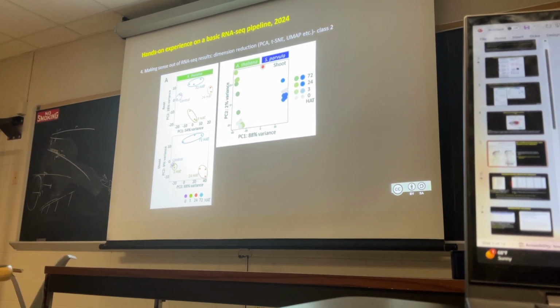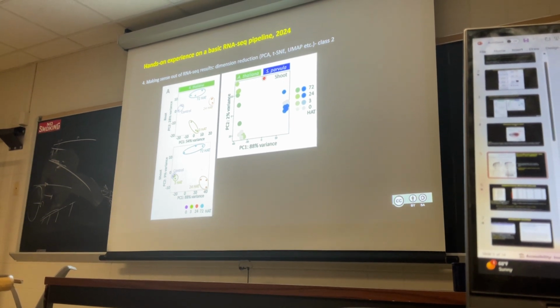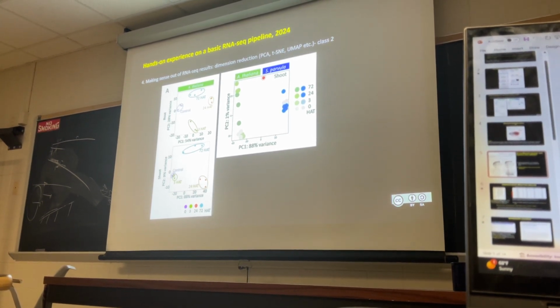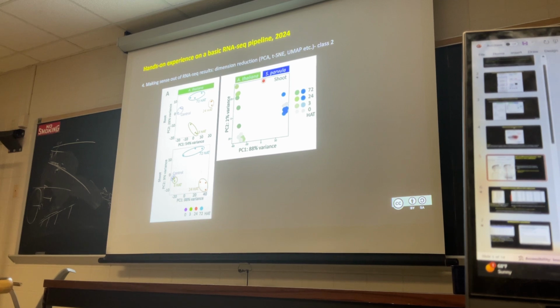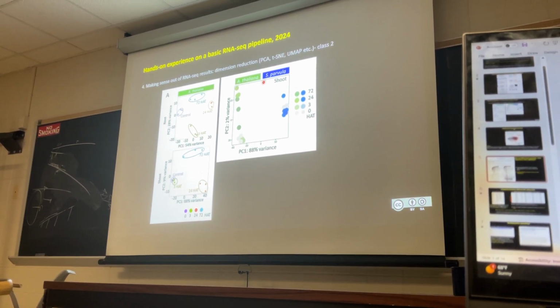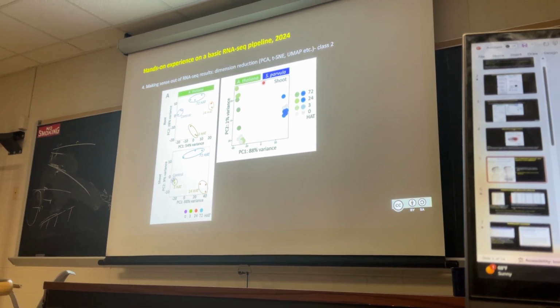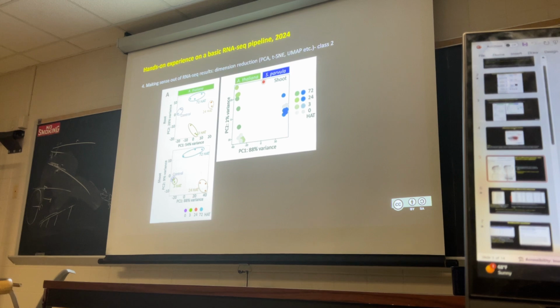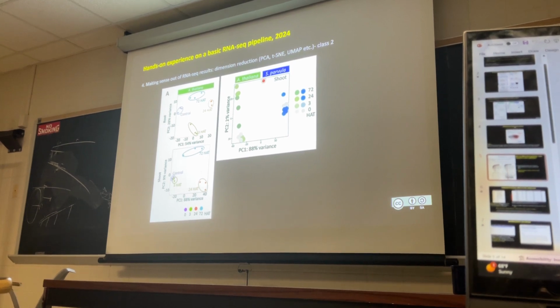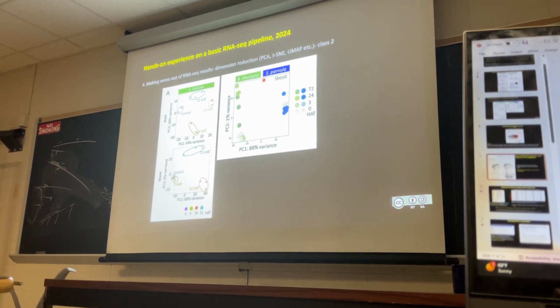So you put those ortholog pairs, and then you now have the gene by sample matrix again. Instead of 27,000, now you have that table for 23,000 and all the samples from both species, right? And then you create the PCA for that. That's what the right figure is. Those are basically showing two different things here, although they look similar.